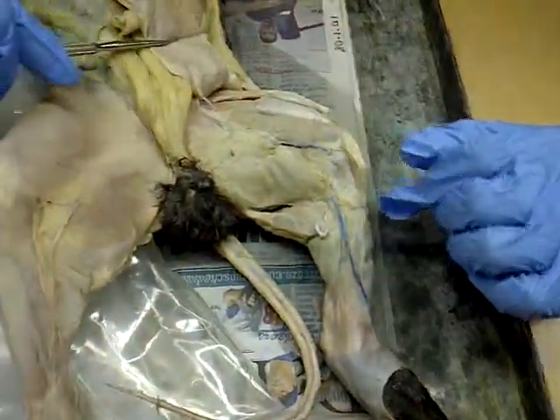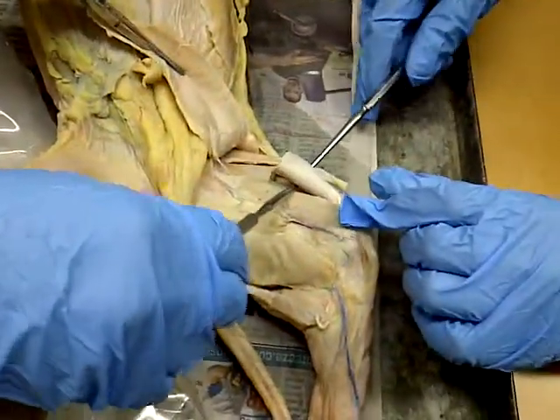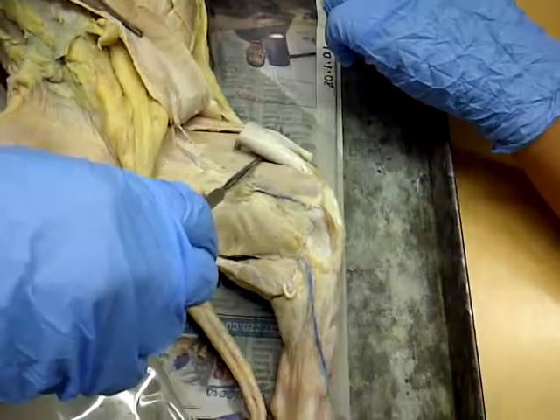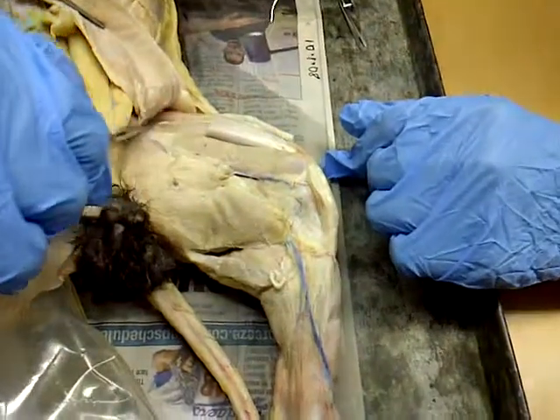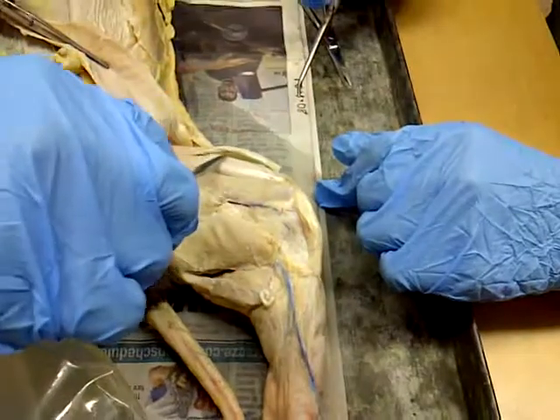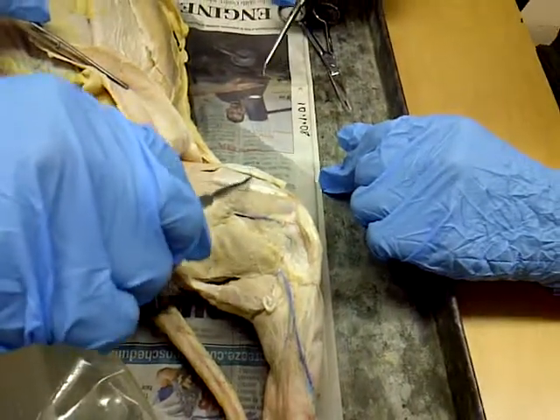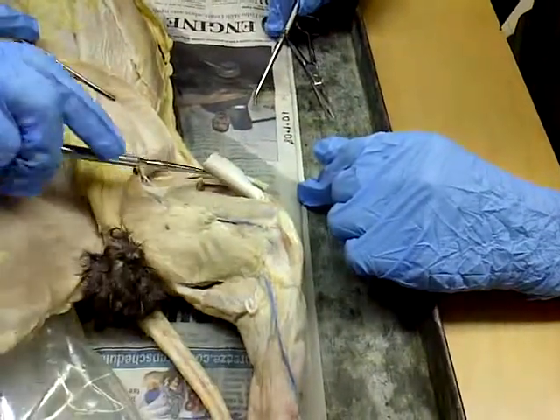And if we flip it over, this cut section right here is the rectus femoris. This is the one I was mixing up with the adductor femoris. This is rectus, and rectus means long, so you know it's the long section that goes from the hip to the knee. Rectus meaning long, like your quads, and femoris meaning it's to the femur. So this is the rectus femoris. I don't know if that helps.